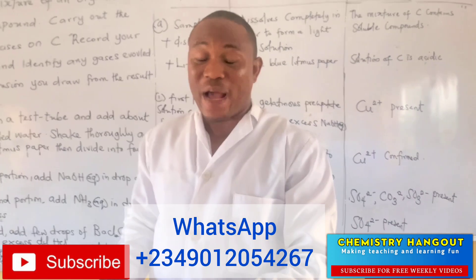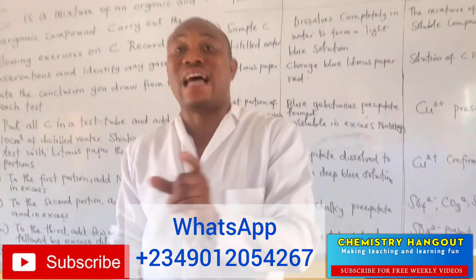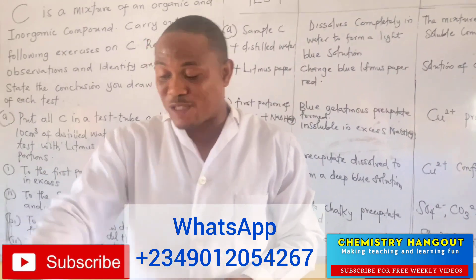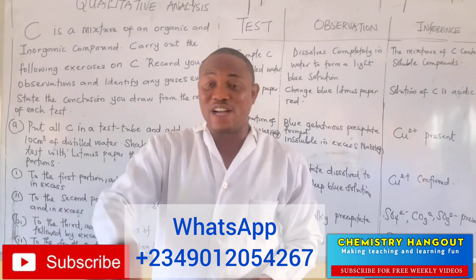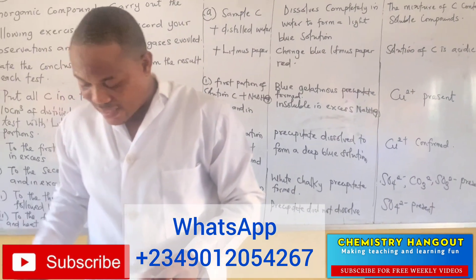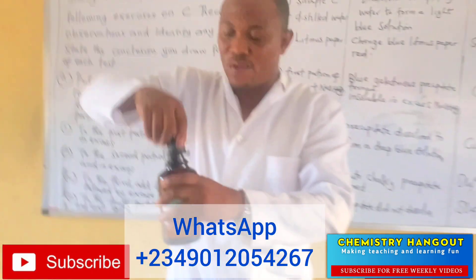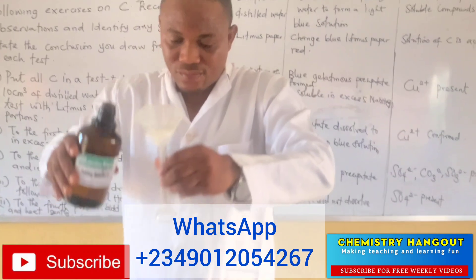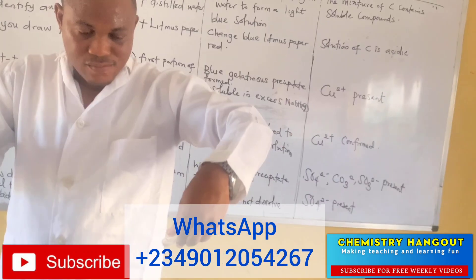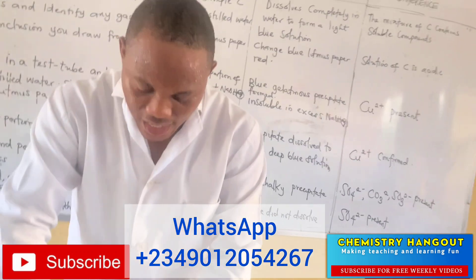You can prepare Fehling's solution A and B, of course. Solution A is basically a copper compound solution. But for solution B, there is something called tartar that you might not easily find. So I advise you to always get the already prepared one. For sodium hydroxide, ammonia, barium chloride — those you can prepare. But for solution A and B, I advise you to always get them ready. Now solution B — two centimeters also. So this is Fehling's solution A and B.